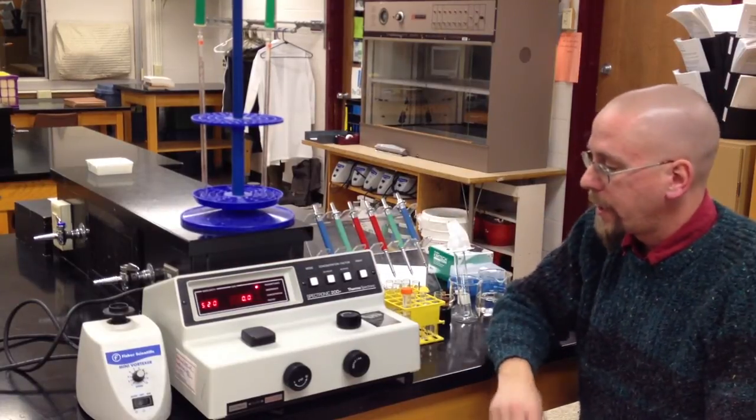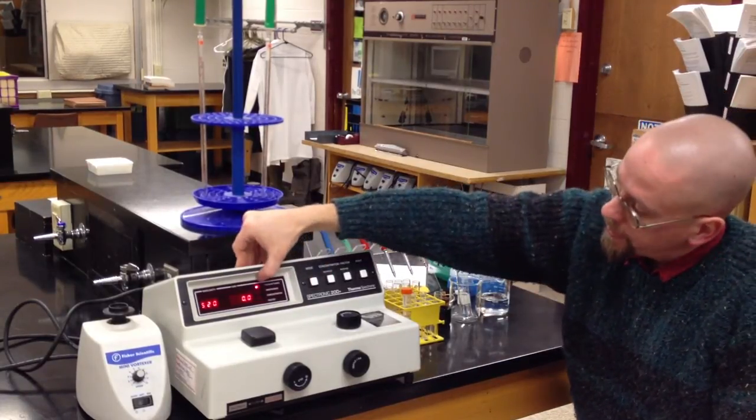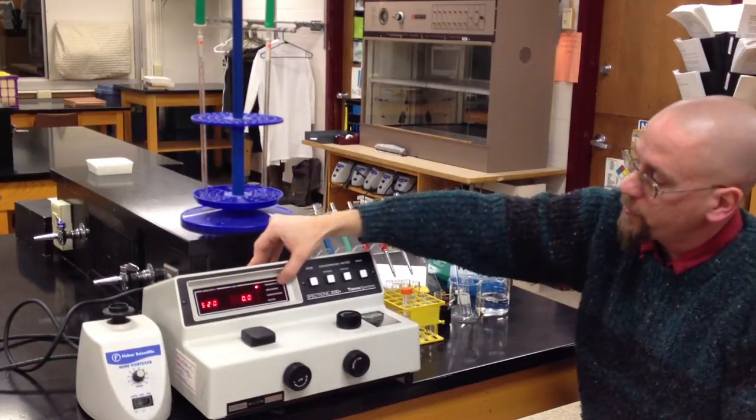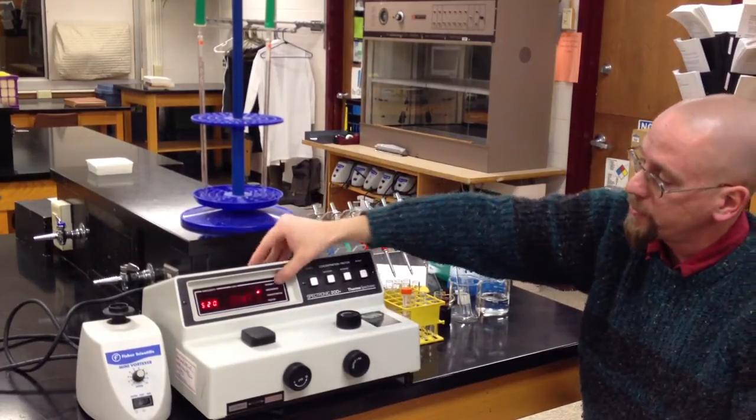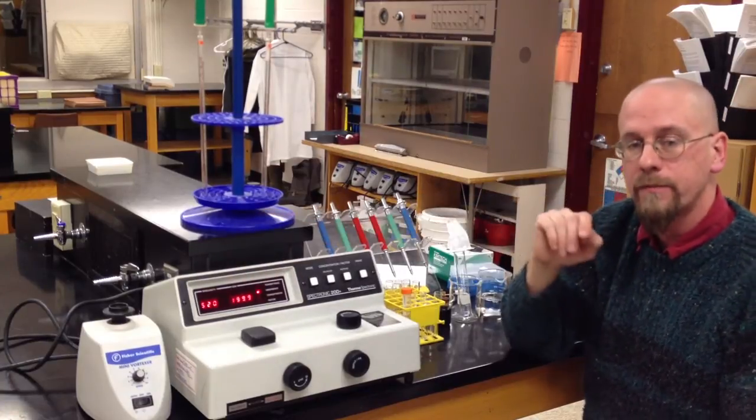Once we've done that, now I can set my mode. The default setting is transmittance. What we are going to measure is absorbance. So if I press the mode button to absorbance, now I get a flashing number. That's just fine.